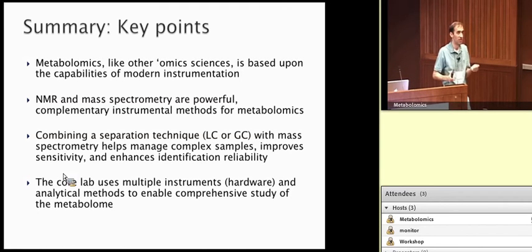But matrix effects would be something where in fact, that signal of 500 did not actually mean a concentration of 1 micromolar in both samples. It might mean that you would get 1 micromolar in one sample, but the true concentration in the other sample would actually be 0.8 micromolar. So it's some characteristic of your sample that induces a difference in the instrument response to the quantity of metabolite that you have. And so how do we manage that?